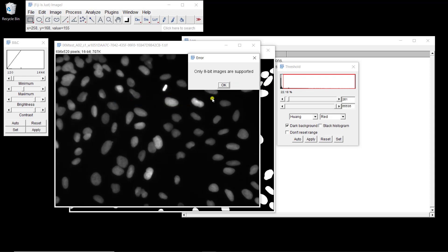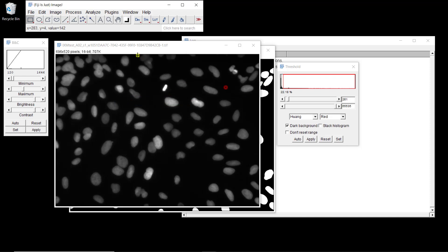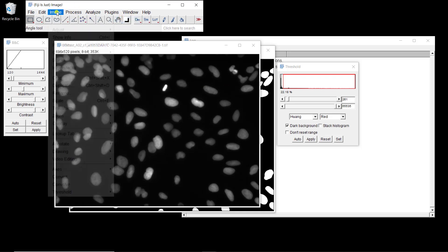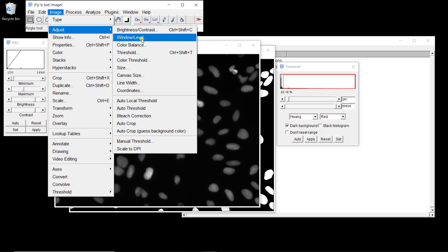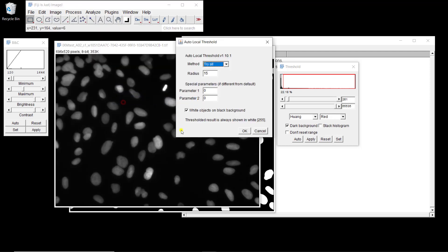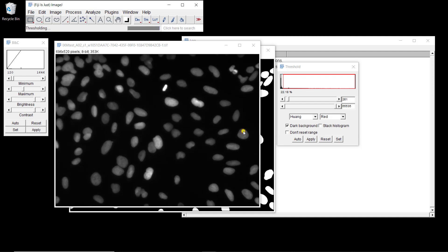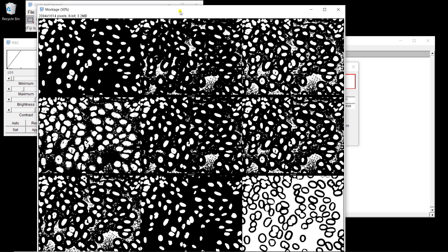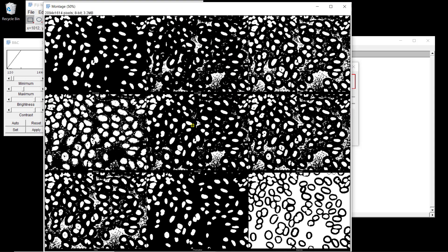These methods were developed only for 8-bit images, so I need to first convert this image to 8-bit. Now I can use it: Image > Adjust > Auto Local Threshold, and I can try them all. You have parameters — one parameter related to the local neighborhood used to estimate the threshold, and for some methods one or two additional parameters. You get a result image similar to the one from global thresholding.